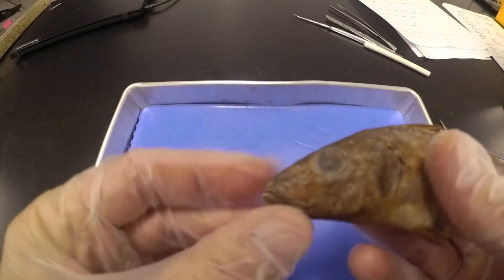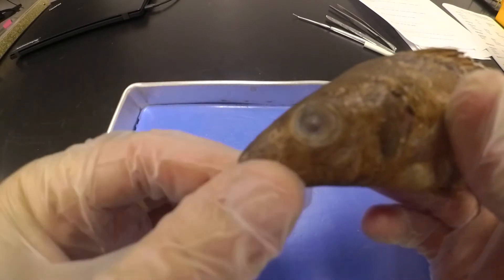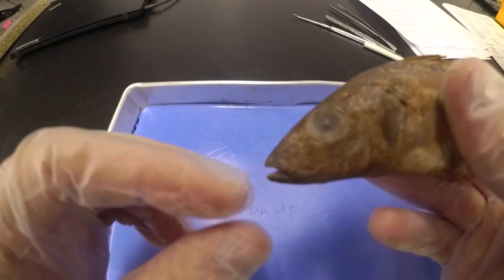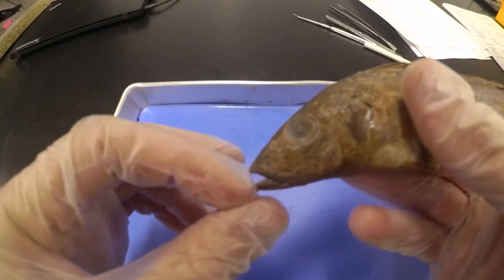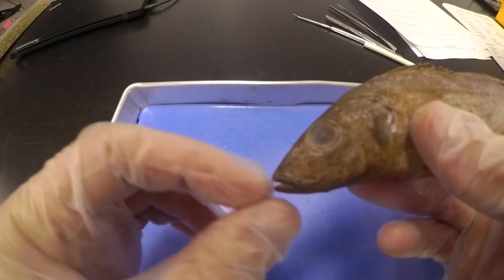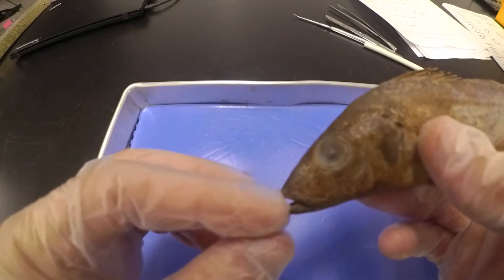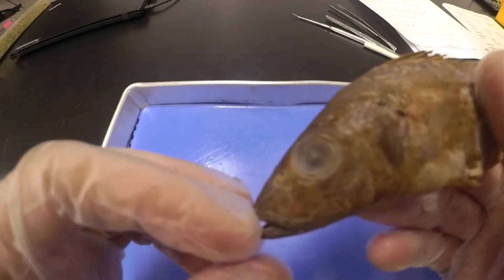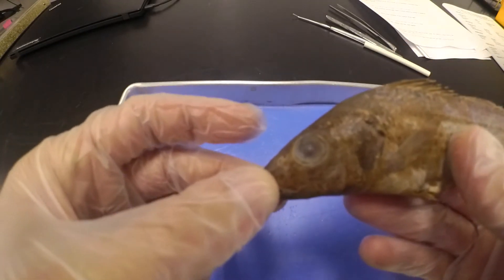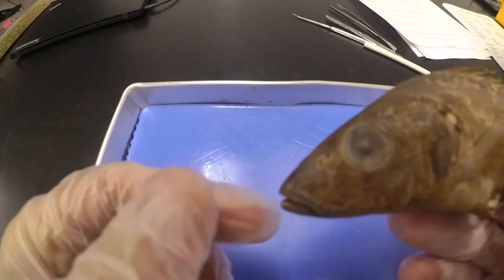Next we're going to look at his mouth. You can see it's located on the bottom of his head, way down on the bottom — it almost opens up straight to the bottom. This is very typical of what you would find on a bottom feeder. Since it's on the bottom, it makes it easy to scoop things from the bottom of wherever he's living. So typically you'd expect something with a mouth like this to be a bottom feeder.